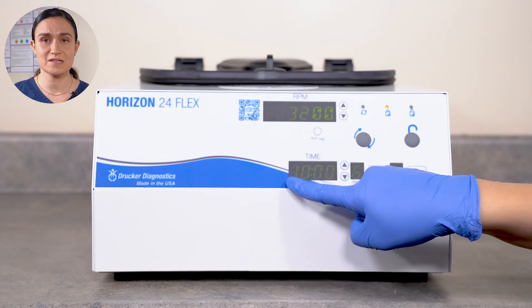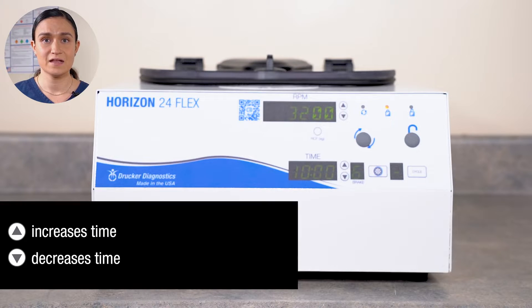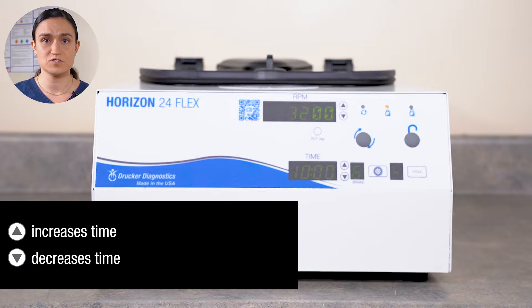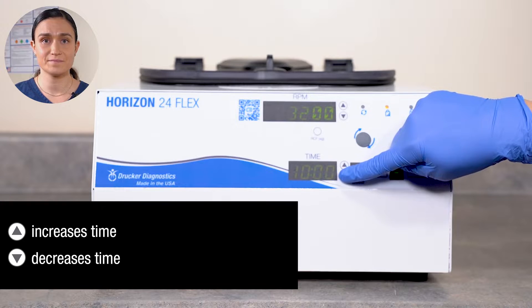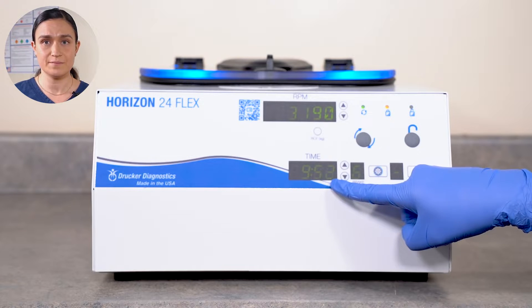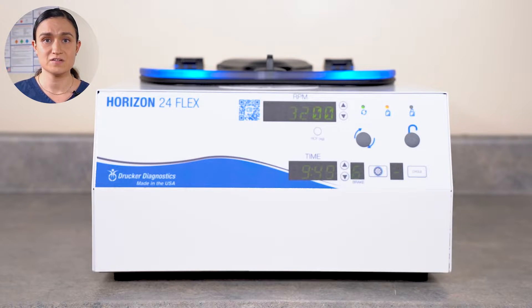The Time display shows the selected time in minutes and seconds. Like RPM, time can be adjusted using the Up and Down buttons next to it. The time shown on the screen will dynamically adjust as you raise or lower it. If you overshoot or undershoot your desired time, you can use the Up and Down buttons next to it to get back to your desired range. When you start your centrifuge, the time screen becomes a countdown timer showing how much time remains. Your centrifuge will spin for a little while before the timer starts counting down — that's because the countdown doesn't start until your centrifuge is up to speed, so your tubes get spun at the appropriate speed for the appropriate time.